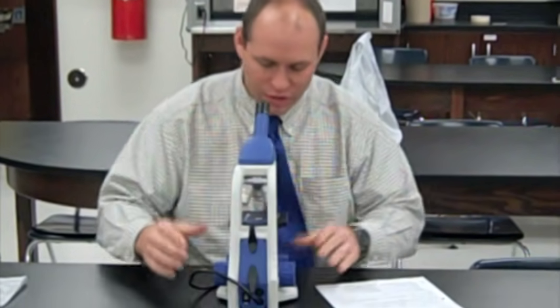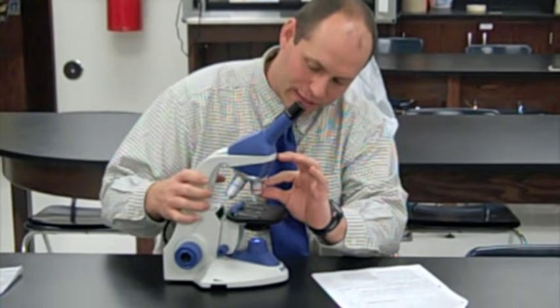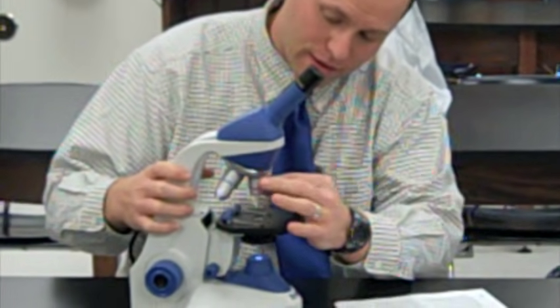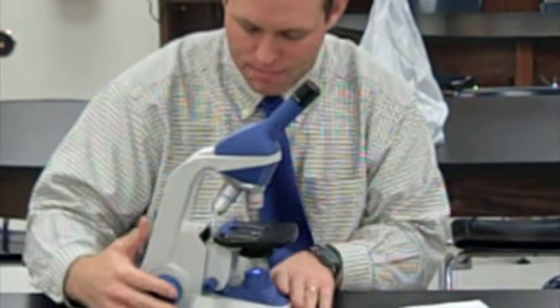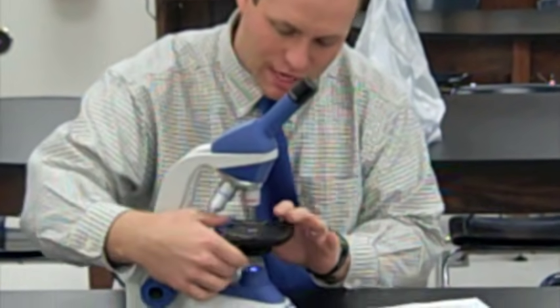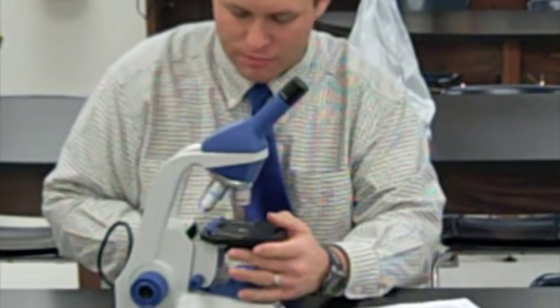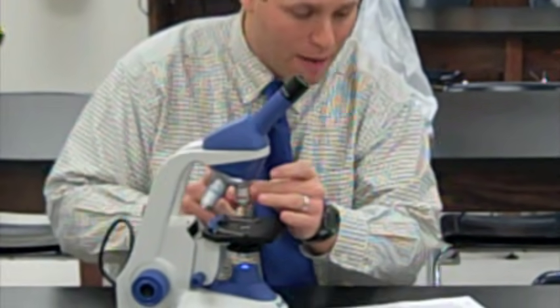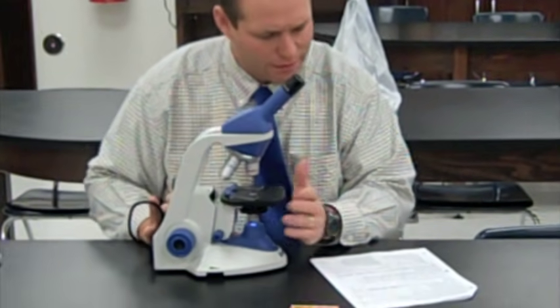Okay. Always start in 4x power. That would be the smallest objective lens that you see right here. Just so we understand what we're looking at, this is, of course, the eyepiece, the arm, the base, the stage clips, and the objective lenses. We're going to start with the objective lenses. That's the low power, the 4x power.